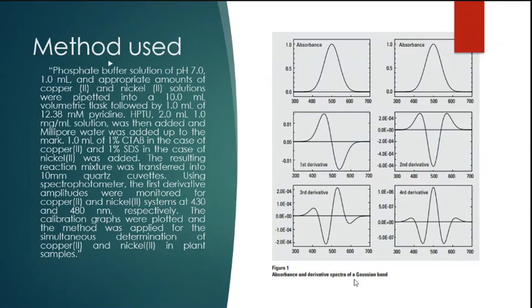First derivative spectrophotometry. Derivative spectroscopy uses first or higher derivatives of absorbance with respect to wavelength for qualitative analysis and for quantification. Figure 1 shows a computer simulation of the effects of derivation on the appearance of a simple Gaussian absorbance band.